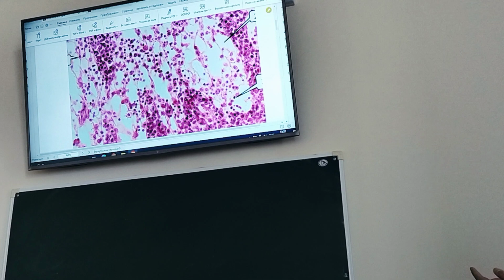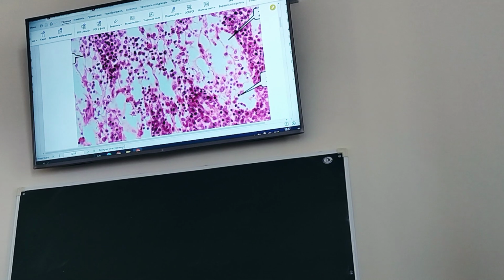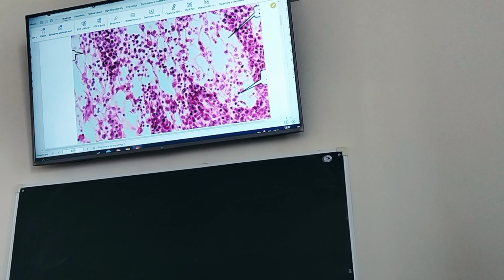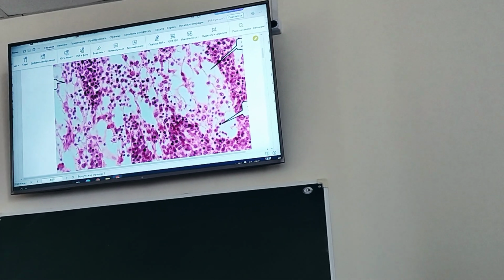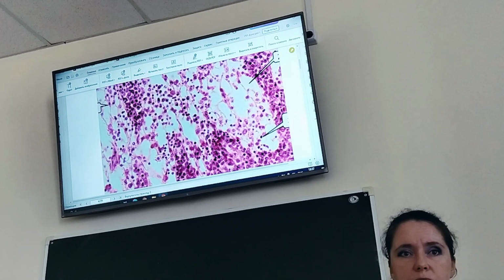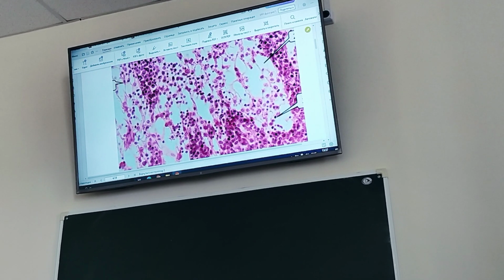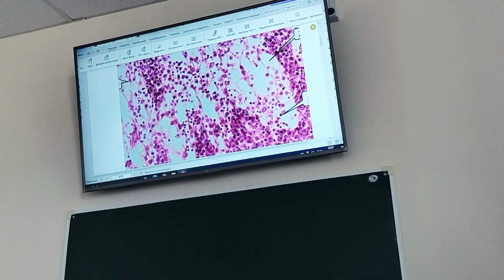Here I can see a spongy structure, sponge-like, porous. Stroma is arranged as a meshwork, or a network. This is due to specific reticular cells, fibroblast-like reticular cells with many processes. If we look at the background, these cells are oxyphilic. They make up a spongy, reticular architecture of the tissue, which functions as a scaffold for another cell type.